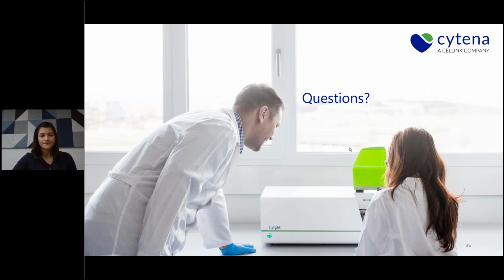How many cells per minute can you clone with the single cell printer? Maybe this can be answered by telling what the time is for printing one plate. For a 96 well plate, if you need about 5 minutes, then it's 5 minutes divided by 96, right? And then you have an imagination.